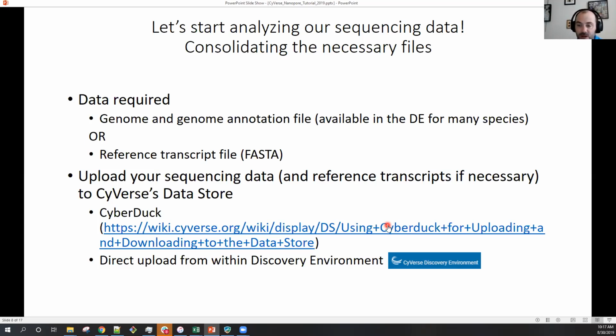So this is if you're performing sequencing and perhaps your computer doesn't have the memory requirements to perform base calling and sequencing at the same time. It's not a big deal. You can easily perform base calling downstream on your own computer at a later date using Oxford Nanopore's proprietary software, Guppy. It's the latest iteration, or the improvement over Albacore, which was their first base calling platform.